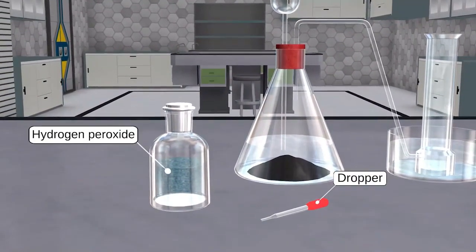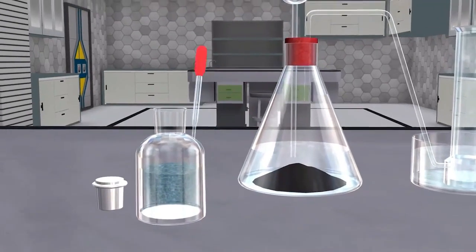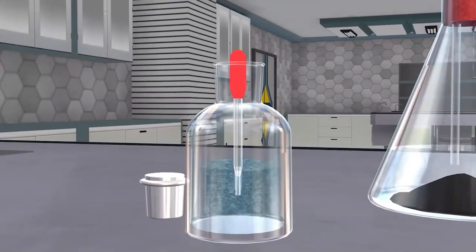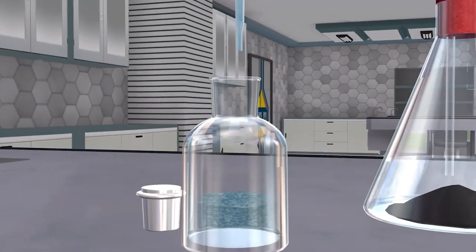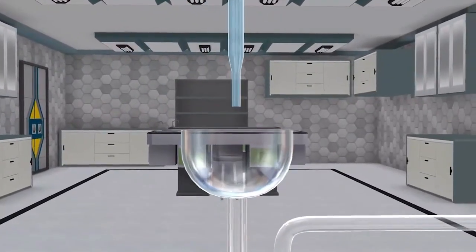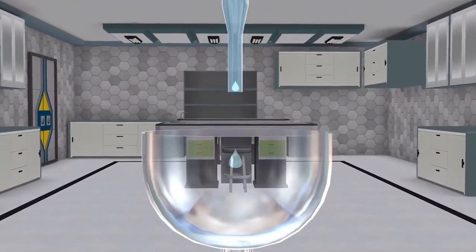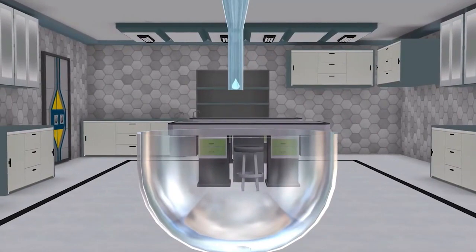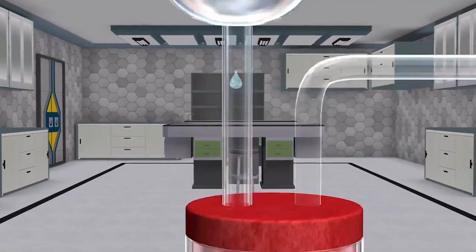First, we will measure out an appropriate amount of manganese dioxide and hydrogen peroxide and place them in the mixing container. It is important to follow the correct proportions to ensure a successful reaction. Next, we will mix the reactants together, making sure that they are well combined.